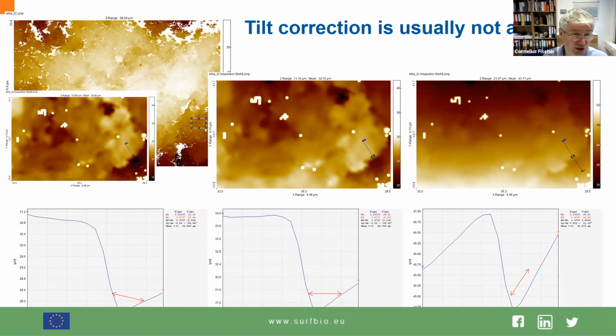Here's an example. I show you this red arrow, more or less in parallel to the bottom line of this pit. If we're now going to rotate things here and really keep this orientation of the red arrow constant, you actually see what's going on here. And I'm no longer in this position as I have shown it here, since it's not a rotation, it's a projection.